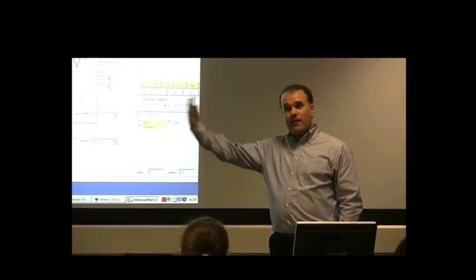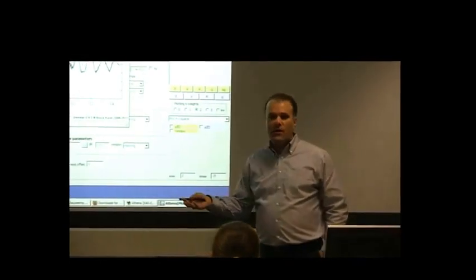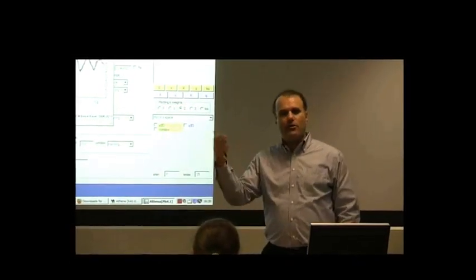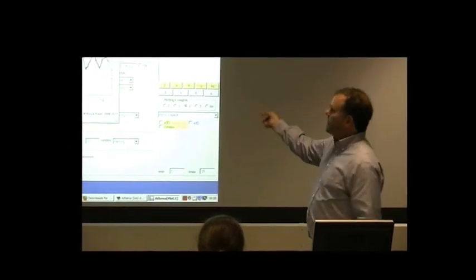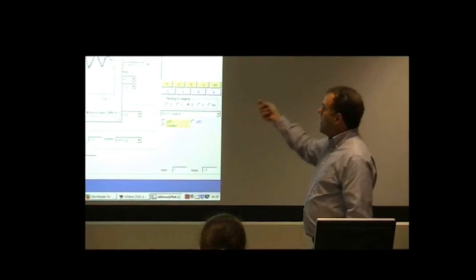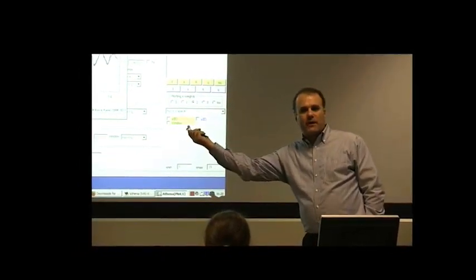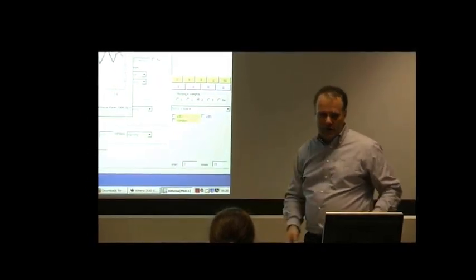And that is, in fact, a typical workflow: you would measure your sample for a half an hour or an hour or 2 hours or however long you need to measure it, process your data nicely in Athena, merge them up, and then go off to Artemis and analyze the merged spectrum. That's a sort of typical workflow through the software. And the way that's done is really quite simple.